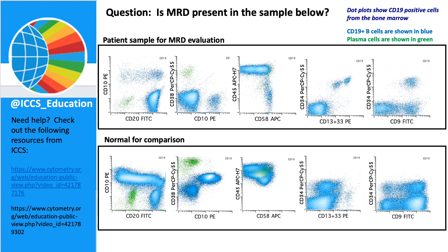Here I have CD19-positive B cells highlighted from a patient sample at the top, which was submitted for MRD evaluation, and at the bottom we have a normal regenerating marrow for comparison. The question is: is there MRD present in this sample? I'd like you to take a look at the patient sample, compare it to the normal sample, and make a determination of whether or not you see MRD present. This might be a good time to pause the video to give yourself a chance to look for the abnormal population. Go ahead and pause.